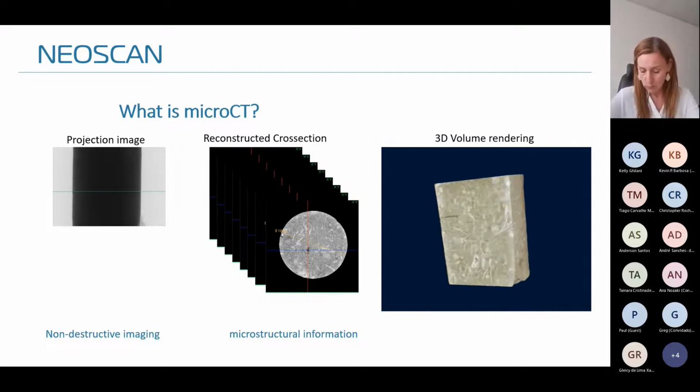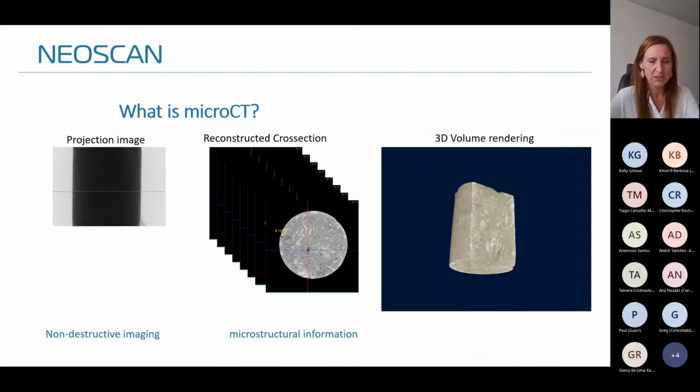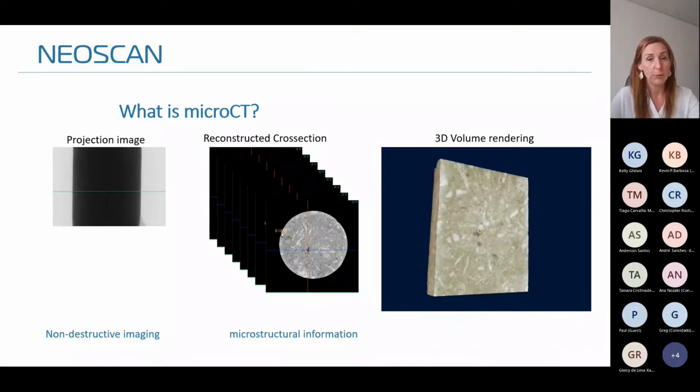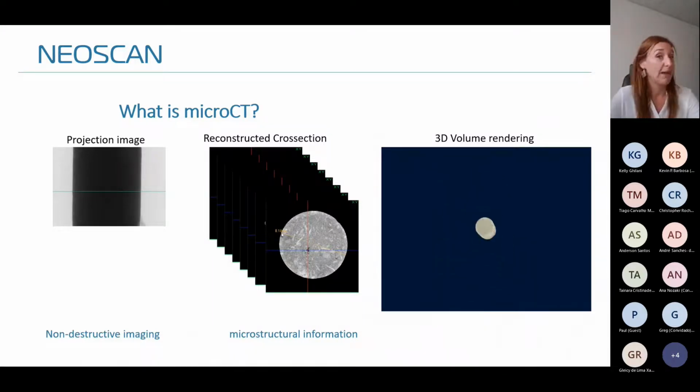So this means that although people are really trying to push the resolution limit of such systems, what they can actually see is in the range of several hundreds of nanometers. So it's not a technology suitable for nanoparticles or such.